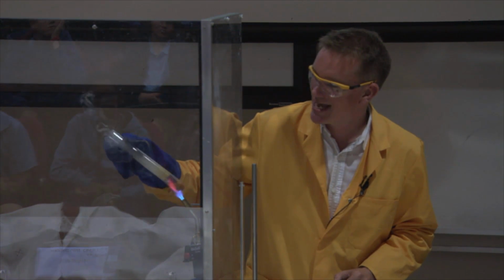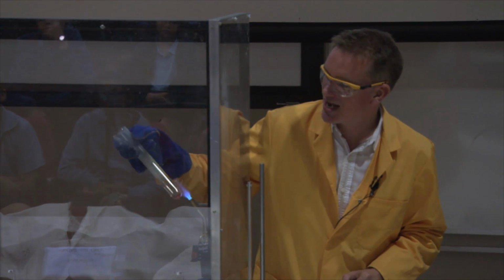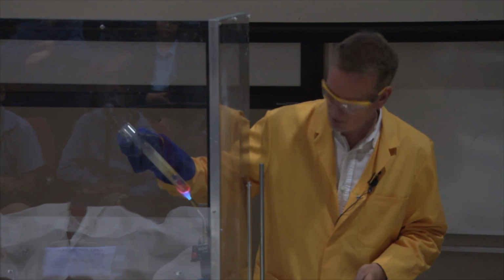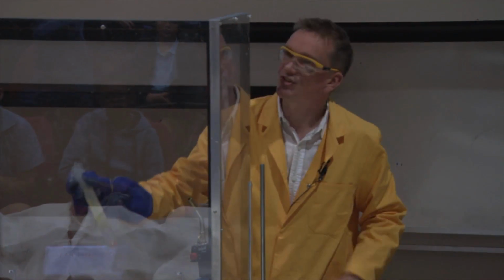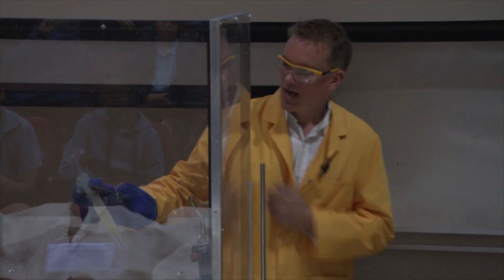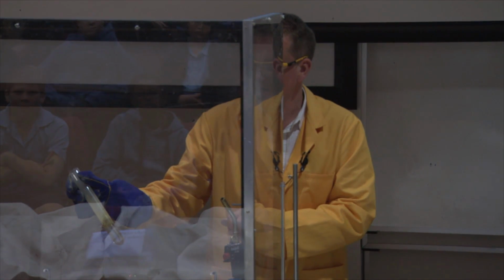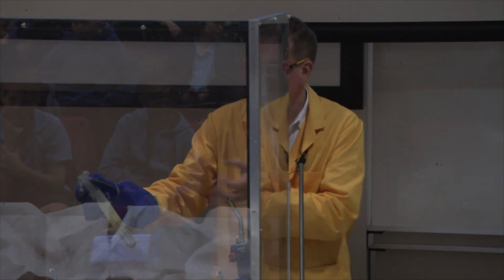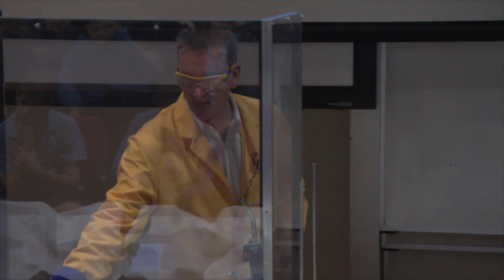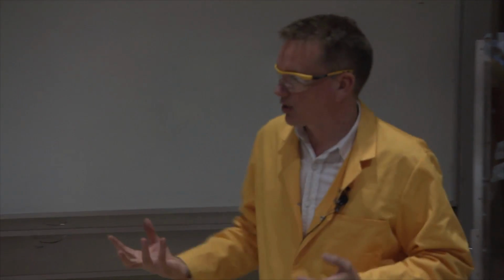And you may be able to see a yellow colour developing round the cooler parts of the tube. And this yellow colour is sulfur. So what we're doing here, we're heating up the iron pyrites and driving out some of the sulfur, and that's the yellow colour that you can see here. Okay, now it's gone black, so it's not a nice shiny gold colour any longer. But we've partially broken it down to give iron sulfide in the bottom and driven out some of that extra sulfur there. So that's one way that we could get some sulfur. Right? So we could get our sulfur from minerals like the iron sulfide, like the iron pyrites. We could drive it out.